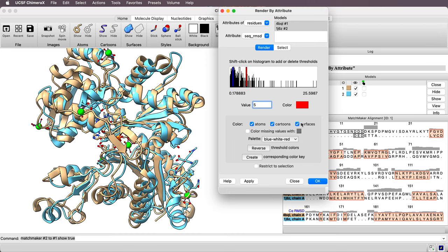And then the white one, I'll put white at 3 angstrom separation. And the red one at 5 angstrom separation. And then there's some options down here to color the atoms, the cartoons.